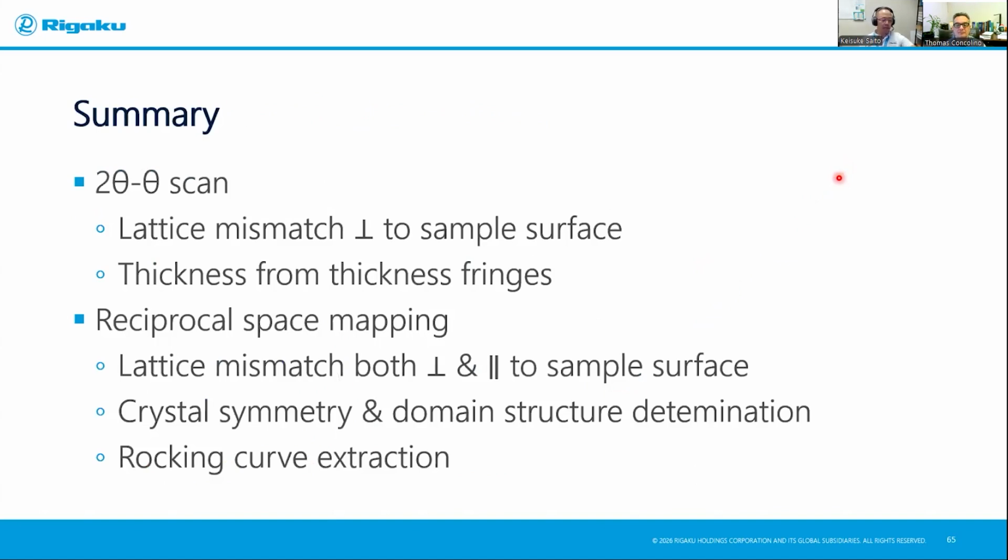All right, let me summarize my talk. I think I have 1-2 minutes to get your questions. Out-of-plane scan, so lattice mismatch.